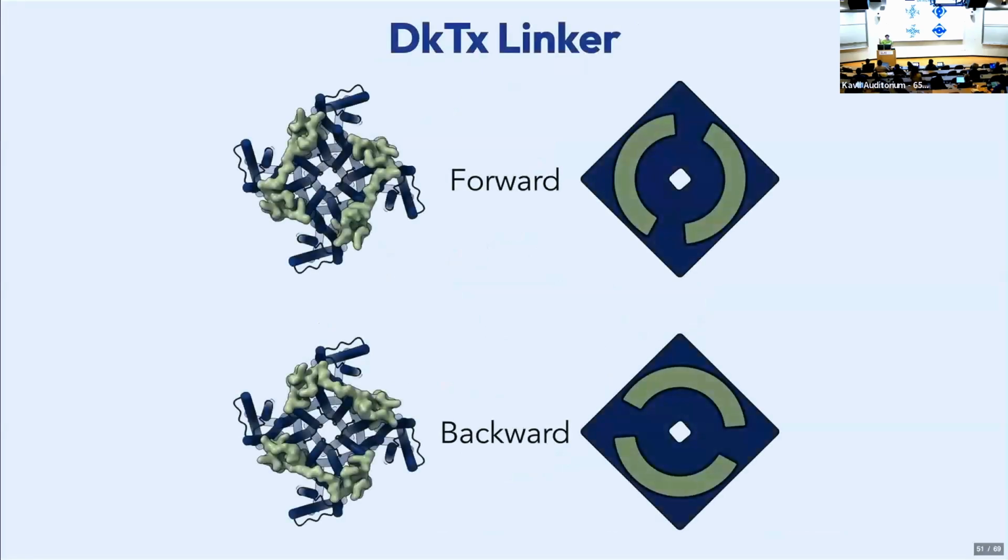Okay. The reason is we imposed that symmetry. It's the same problem that we ran into with calmodulin, but in this case, the part that is asymmetric is so much smaller that we didn't notice it at first, right? We actually have these two conformations. I'm calling them forward and backward here, but they're not even really conformations, because this isn't a real physical thing. This is all related to the convention that we chose. We're saying these are in two different orientations, because it is just how we've aligned the images. All of these particles only have linkers either on those pairs of knots or these pairs of knots, because there's two molecules here, so there's only two linkers, okay?